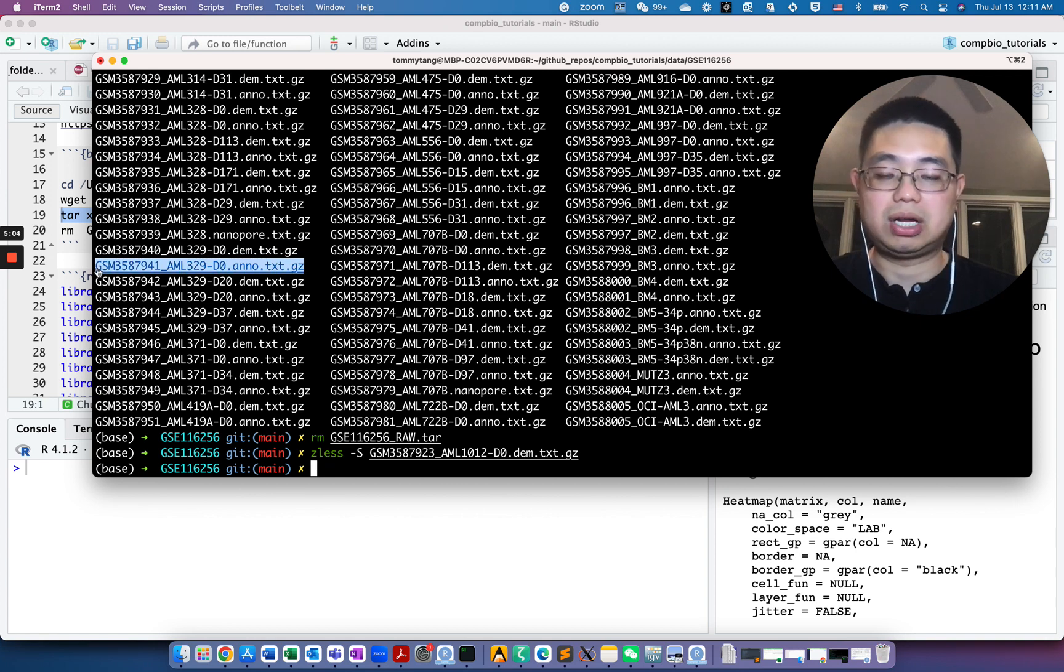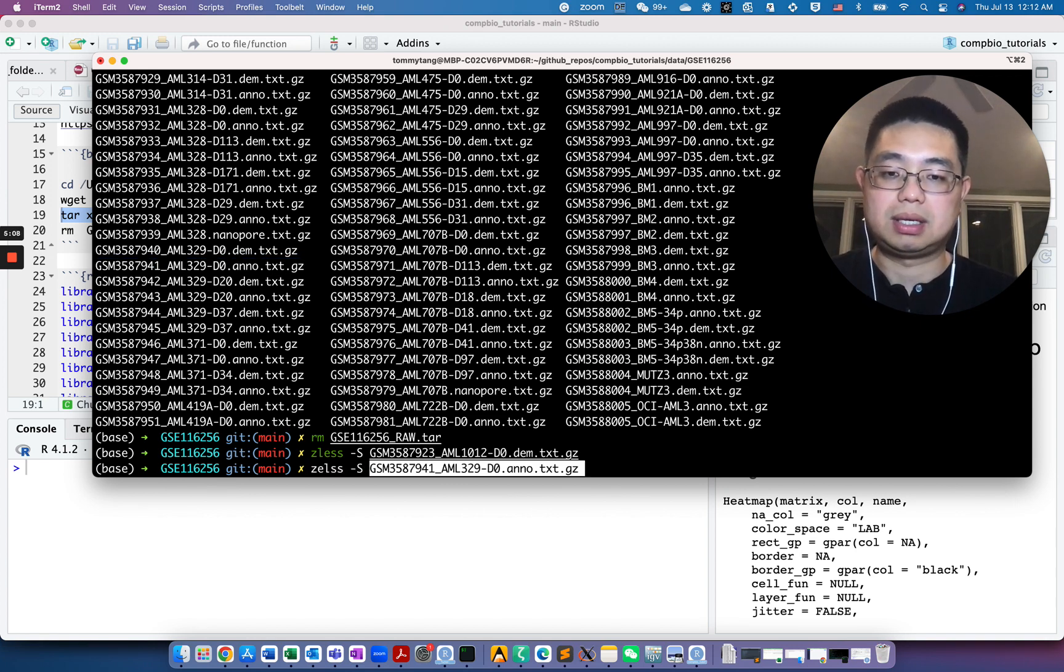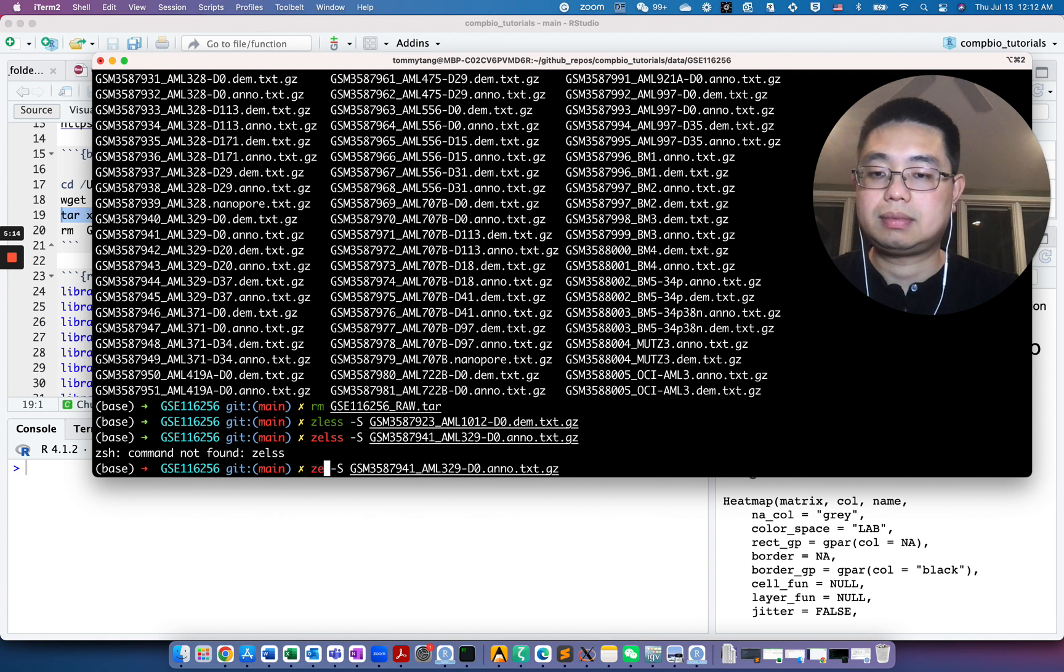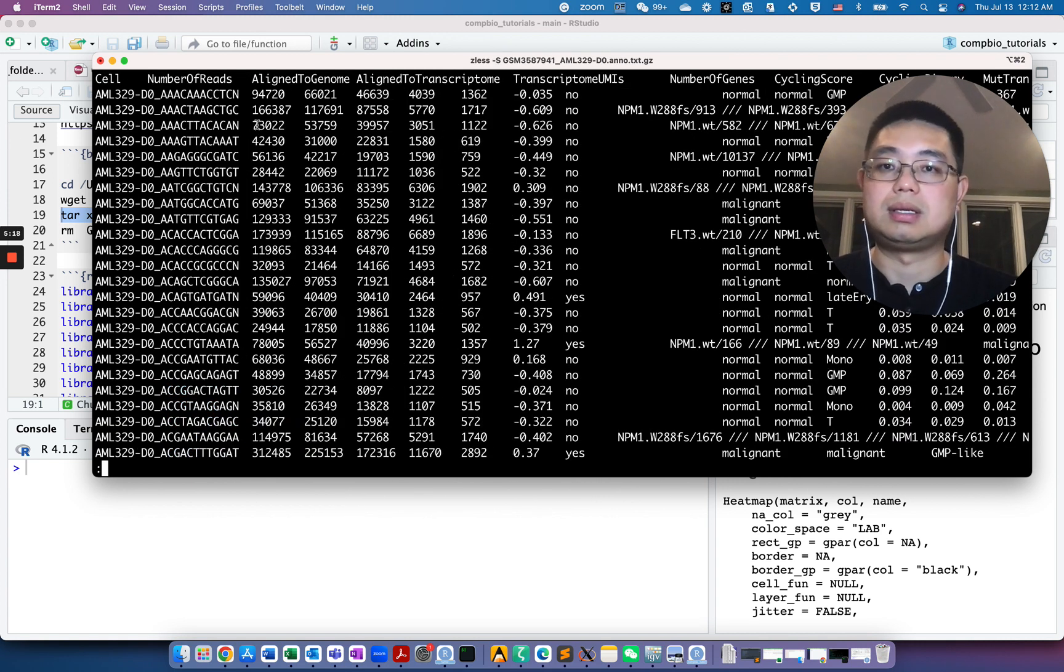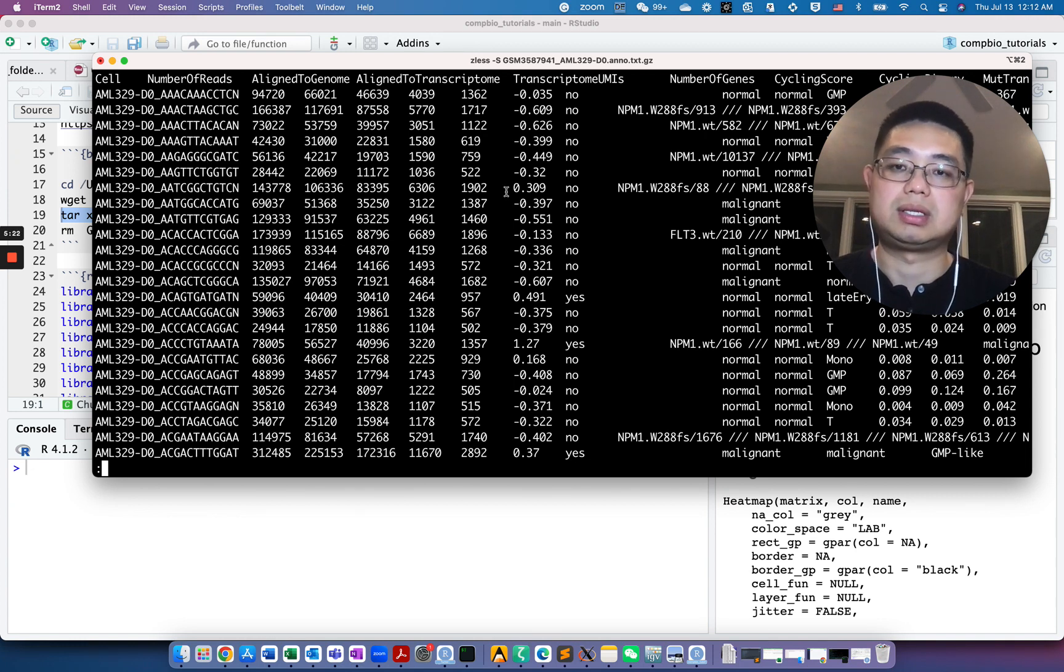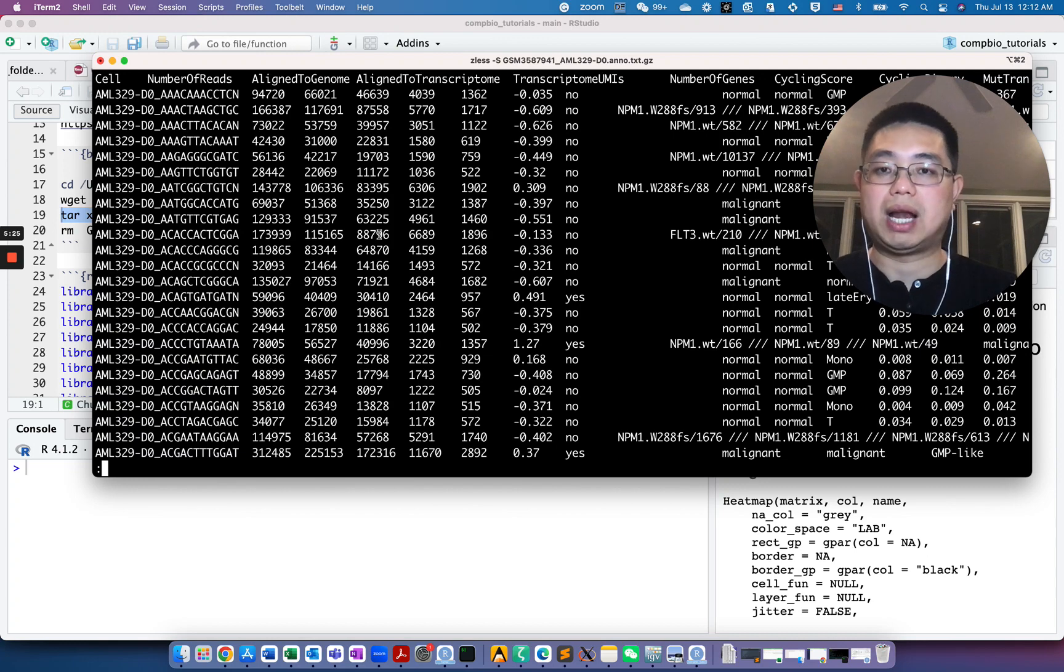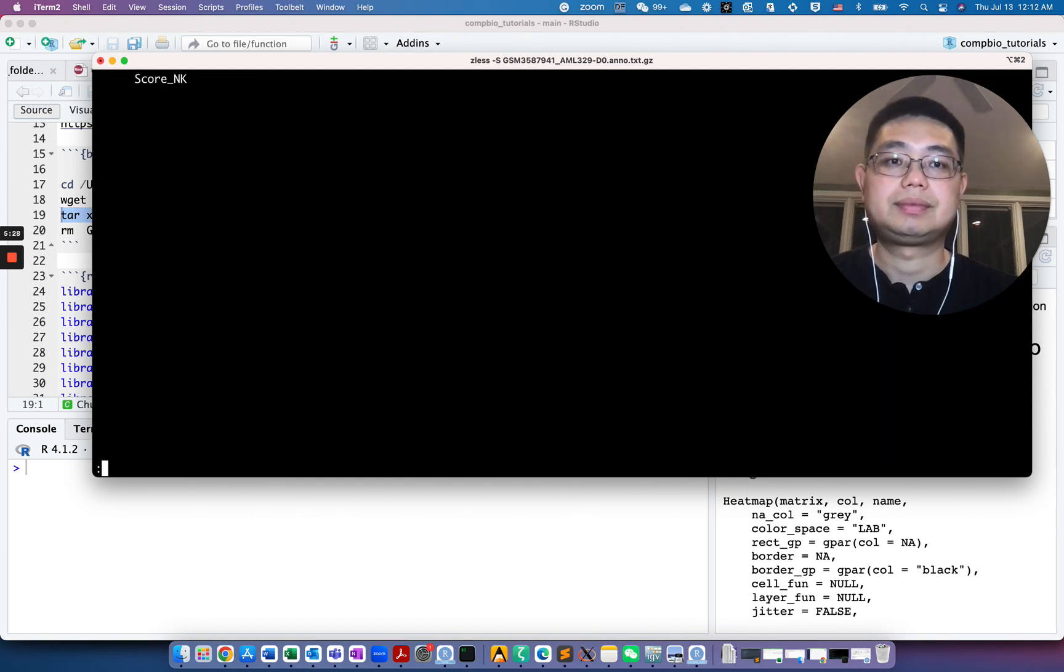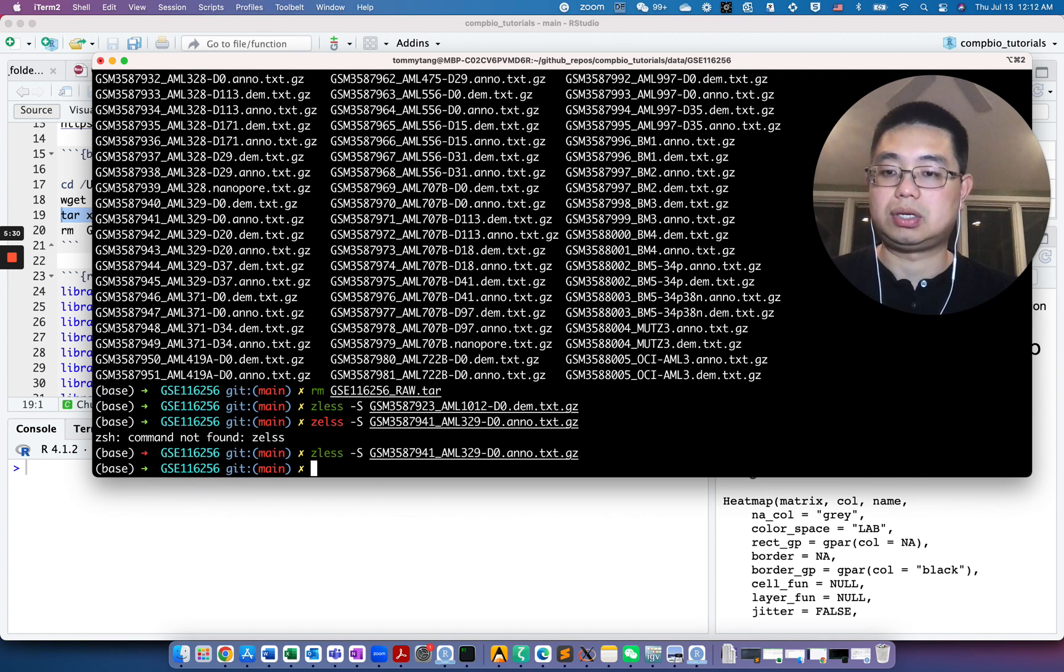Let's press Q to quit and let's look at the other file. This is the annotation file. Use the same command but it's the annotation file. So essentially this is just the metadata column for each cell. You can insert this into the Seurat object metadata slot.